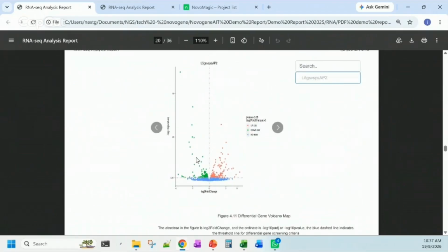And then one of the signature plots for differential expression analysis is the Volcano plot. This normally tells the magnitude of their differential expression. If a point is very high in the plot, that normally means the significance level is high, as this is the negative log p-value.